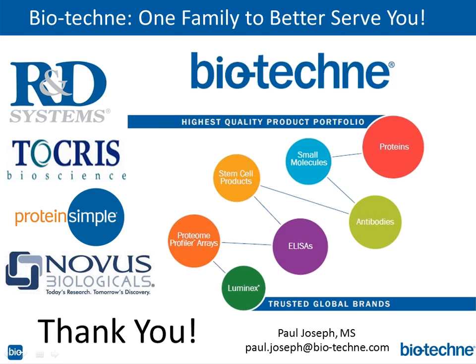You've got so many epitopes for so many antibodies, and you're basically going to bind up all those epitopes. Now, I bet there's data in-house that's going to completely contradict me here, but at some point, you're going to get a robust signal that I don't think is going to increase much more, unless you start getting more background, and you say, well, that's part of my band, when it really is not.